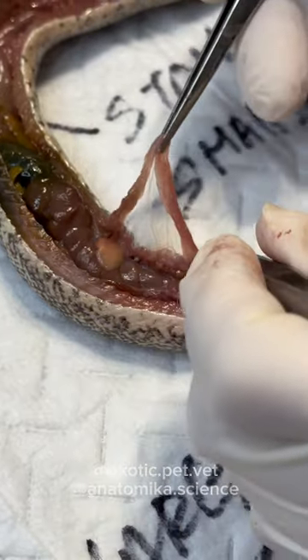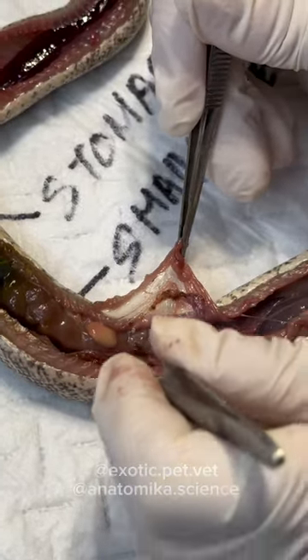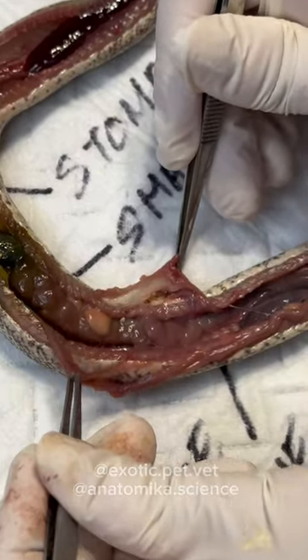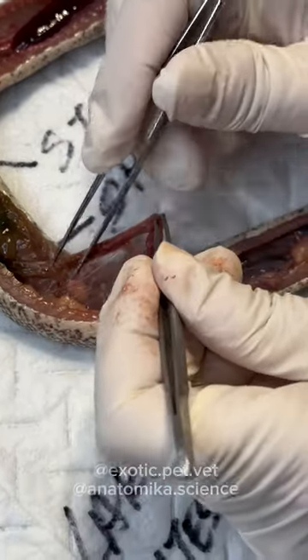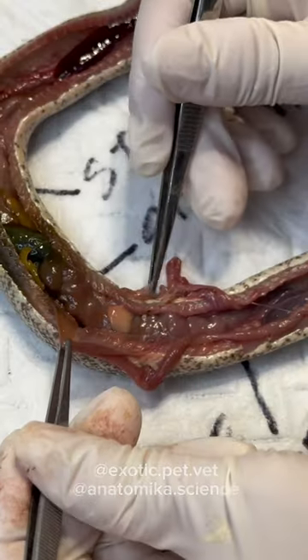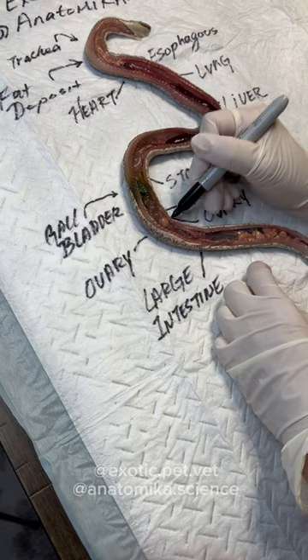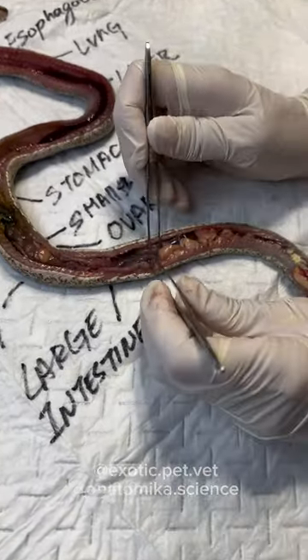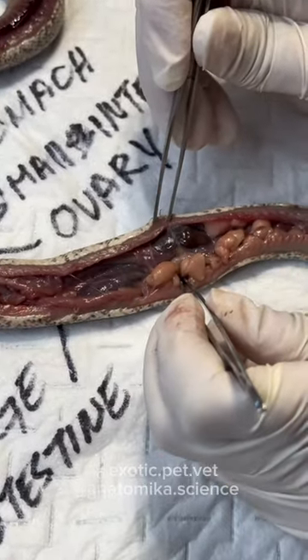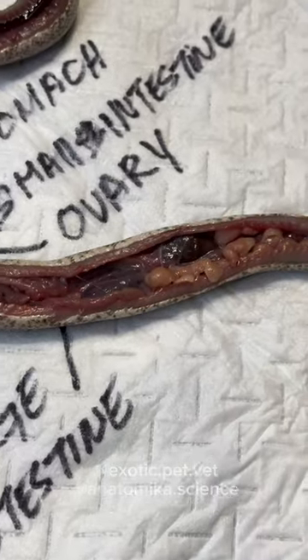The right side ovary is always a little bit in front of the left — just like the kidneys, where the right side is in front of the left. Those are the ovaries. Here we have the kidneys — one here, another one here, the right and the left, the right one's in front. In snakes, the kidneys look like a stack of coins that fell over.